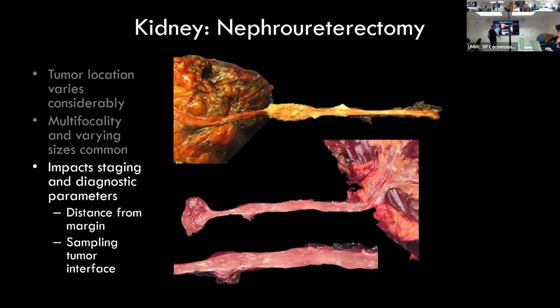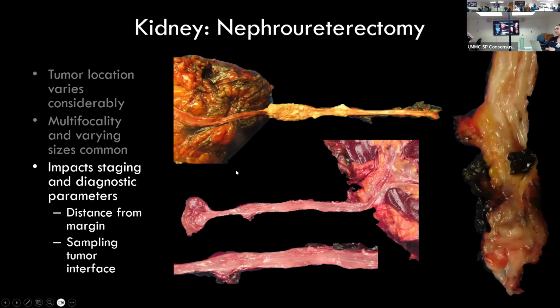So the cancer in this case is actually here. Okay, so little granular structures. In some cases, it might be even more difficult, so it might be really hard to see where the cancer is. But notice this particular area where it's a little bit shiny, it's a little bit elevated, and it's also a little bit coarser and granular. So that is the cancer.